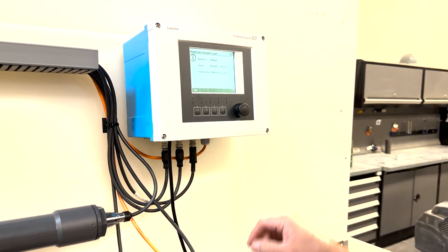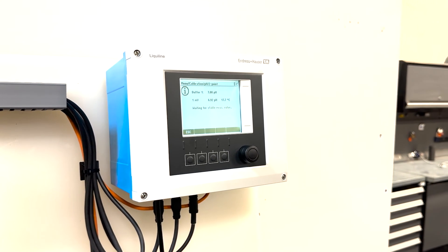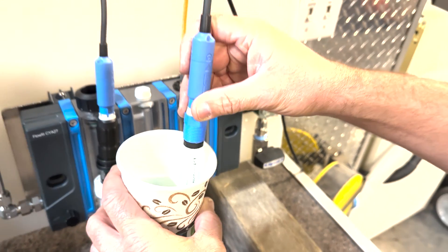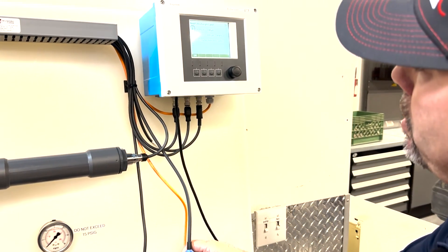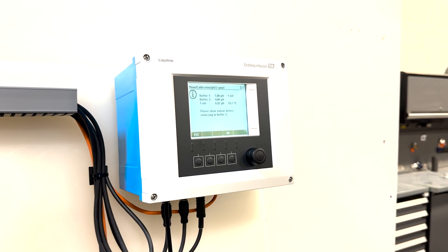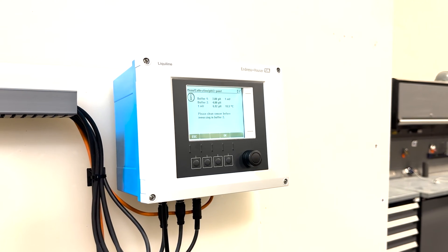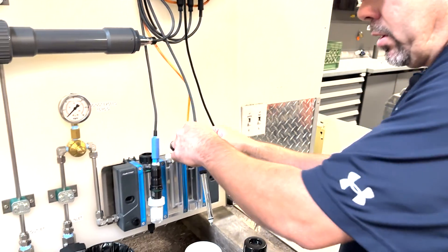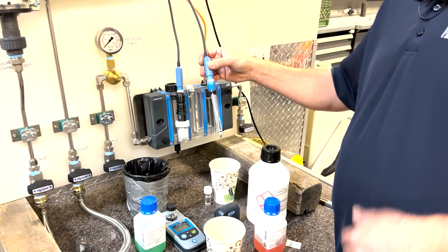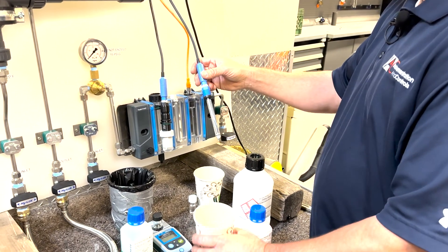We're going to hit OK and it's going to give us a stable value — it's going to automatically look to see what value you're reading. You may want to stir the sensor and make sure that the sensor tip is completely submerged in the solution. Stir it slowly; you're just looking to get a good reading. We got our reading: it was 6.92 versus a 7. Now it says please clean sensor before immersing in buffer solution 2. You don't want to contaminate the second buffer solution.